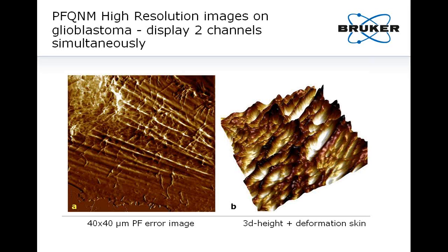So the next slide gives a representative example of what can be expected in terms of lateral resolution when using PeakForce Tapping or PeakForce QNM. So typically living cells are pretty hard to image in contact mode or tapping mode, and impossible to image by using force volume, except if you want to go for a very low resolution.